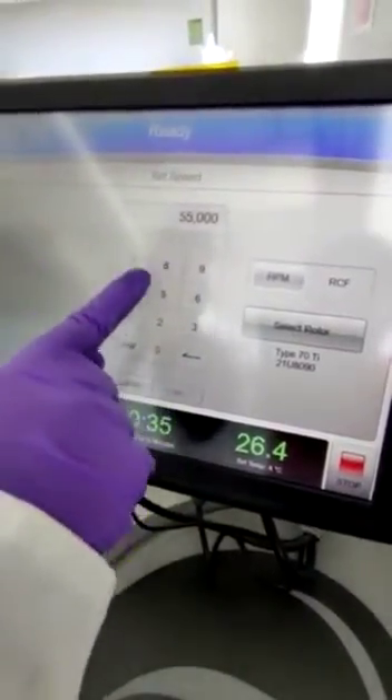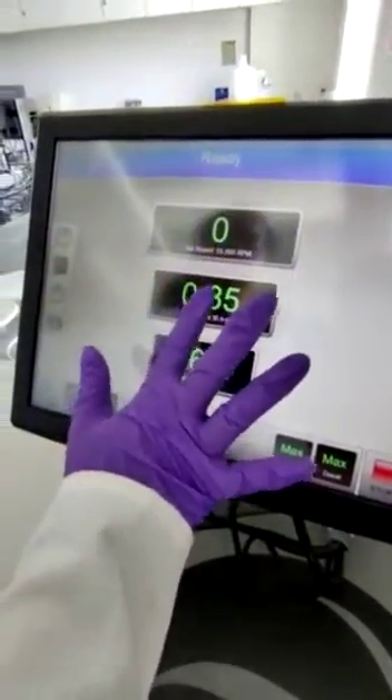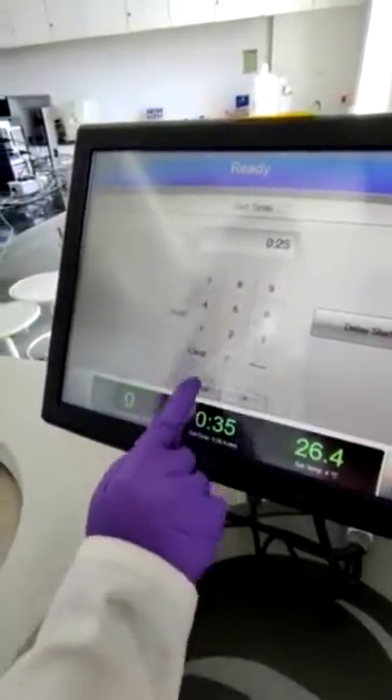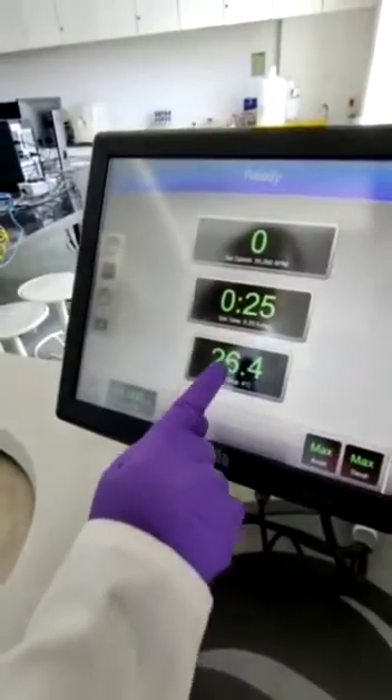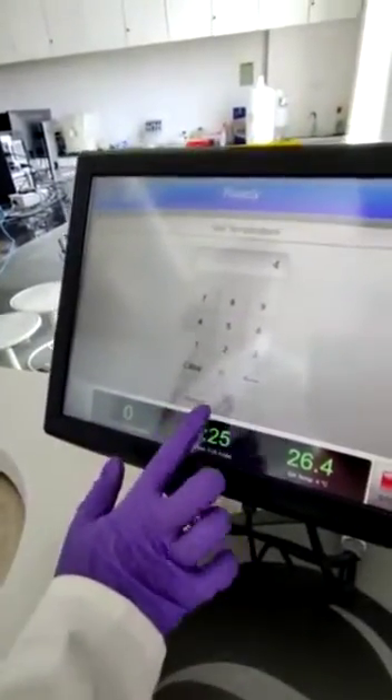We can set the speed — it is already set to 55,000 rpm, and it can go up to 60,000 rpm. We can also set the time, for example 25 minutes, and the temperature, which is already set at 4 degrees Celsius.